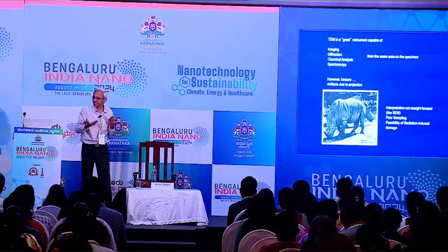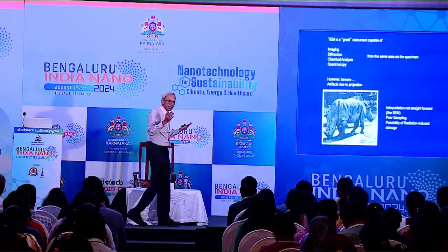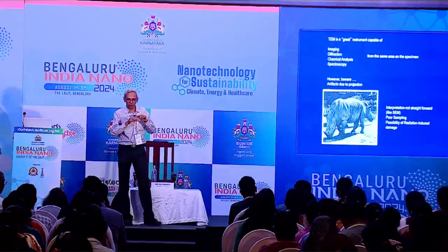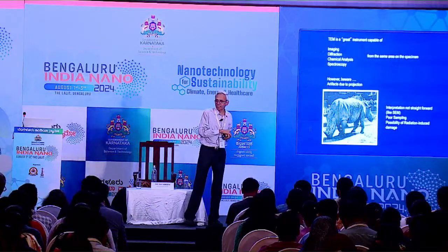Okay, by analyzing the X-rays that are coming out from the material when the electron impinges on it, you can characterize what the elements are, EDAX as it is called. EDAX, by the way, is the name of a company. Okay, EDS is the technique. So EDS is what we can do to find out what the elements are.